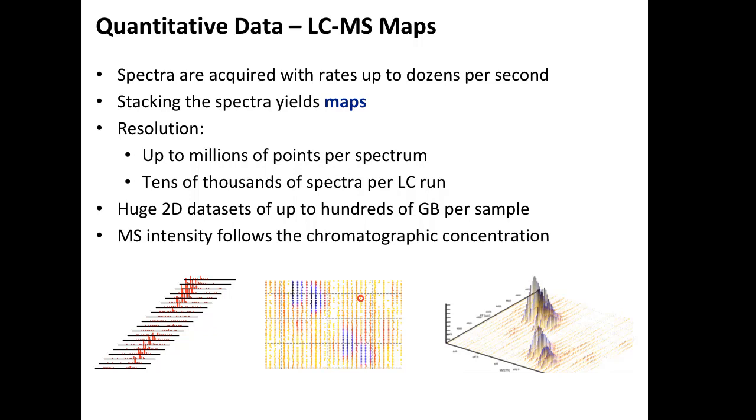then we need to go two-dimensional. Yesterday, what we discussed were just spectra of peptides. Today, we're going to be talking about spectra of peptides, but the second dimension that we will add is retention time. Remember what I showed you, we need to integrate over retention time in order to quantify properly.